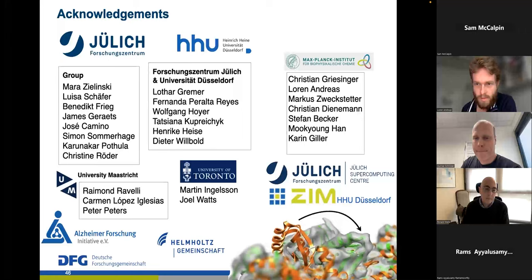So Moses Milchberg would like to know, he says, a lipid to protein ratio of 5:1, which was used in the lipidic fibril structures, is very small. While it's definitely more amenable to solving high-resolution cryo-EM, might such a small amount of lipid vesicles bias the structures?